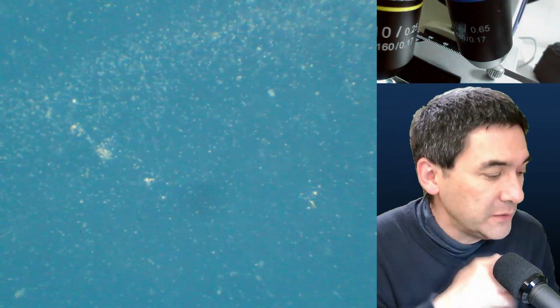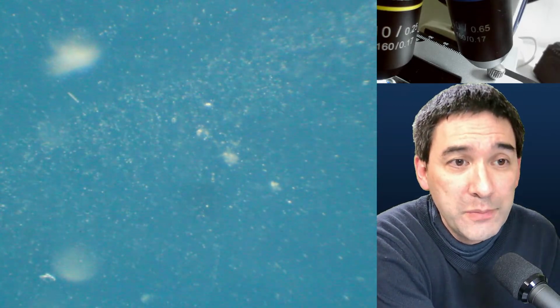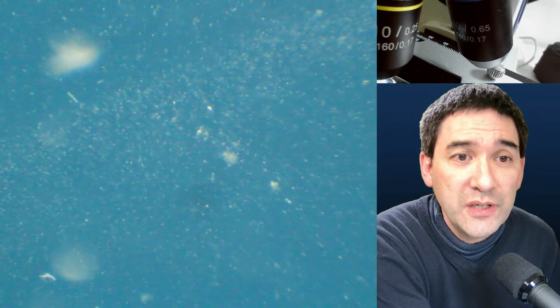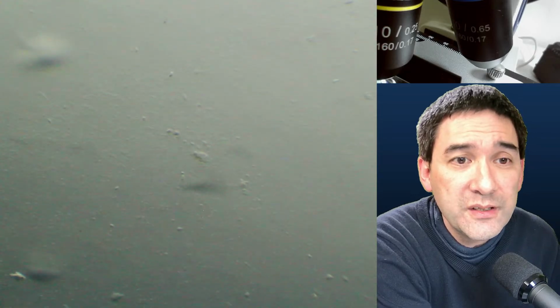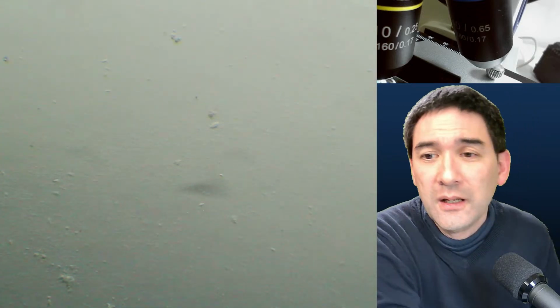If you tuned in a little bit later, we're now looking at bacteria, and I just wanted to demonstrate how those bacteria look in dark field. Right now I'm just using a filter, and by shifting it over, reducing it, we have again a little bit of oblique illumination, which is something that I just showed you. Now I'm not able to see it very well for whatever reason.